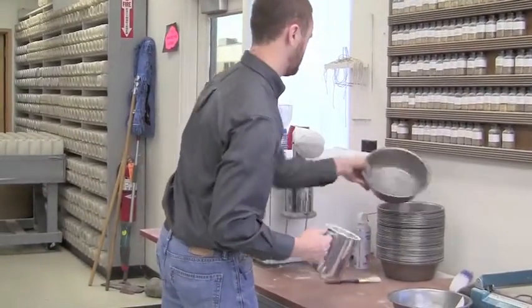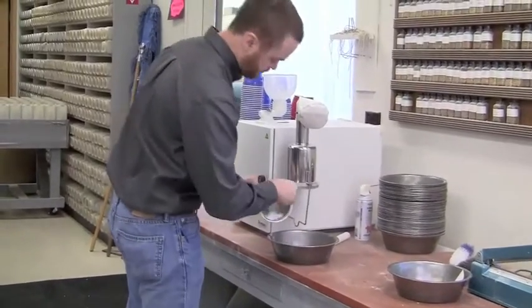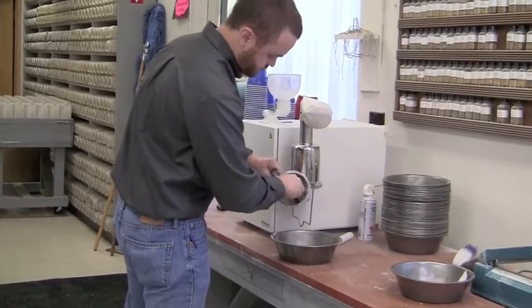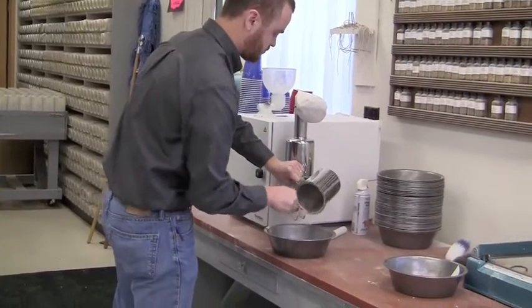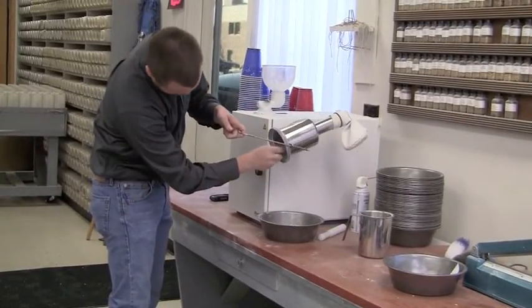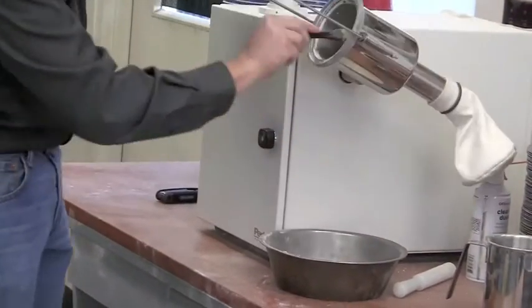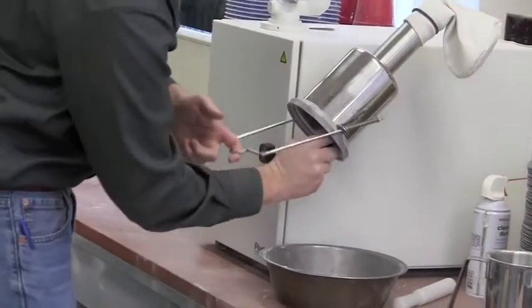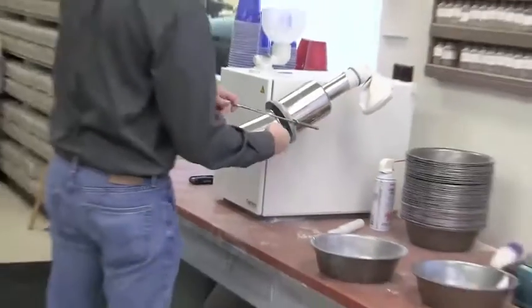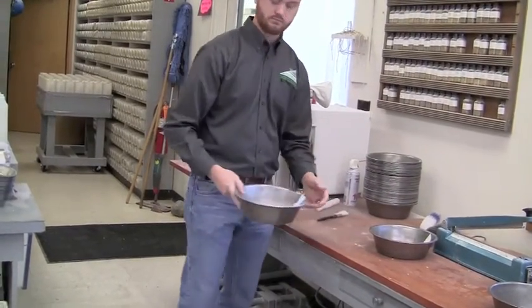Now Scott will take the flour out, and then the machine is cleaned after every sample to prevent contamination, and ready for the next sample.